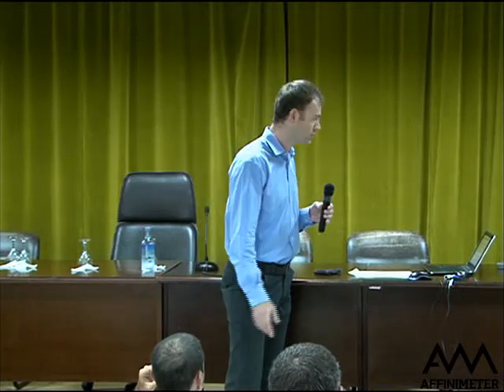Is this bad? To be honest, personally, I don't think that this is bad, because what you will see with a lot of very complex models is that you have so many parameters that you can easily fit any kind of data as long as you add enough parameters. So actually, we'll see later on, if you are going to use complex models, you really need to understand what those models mean, and actually also what they don't mean.